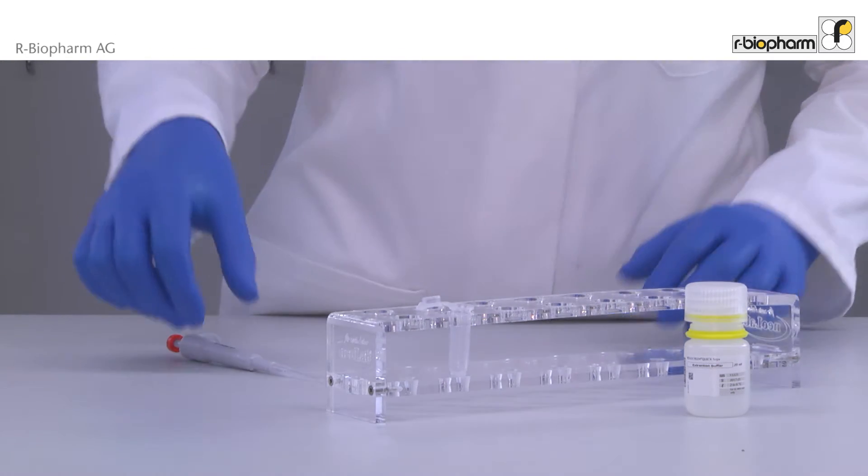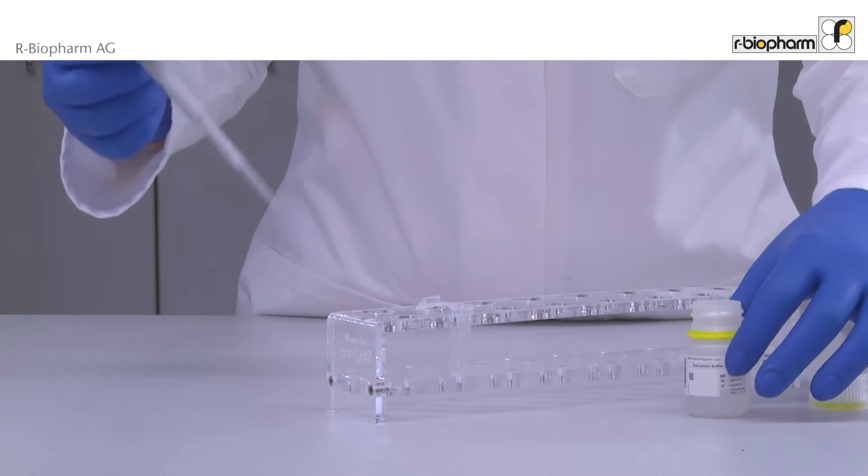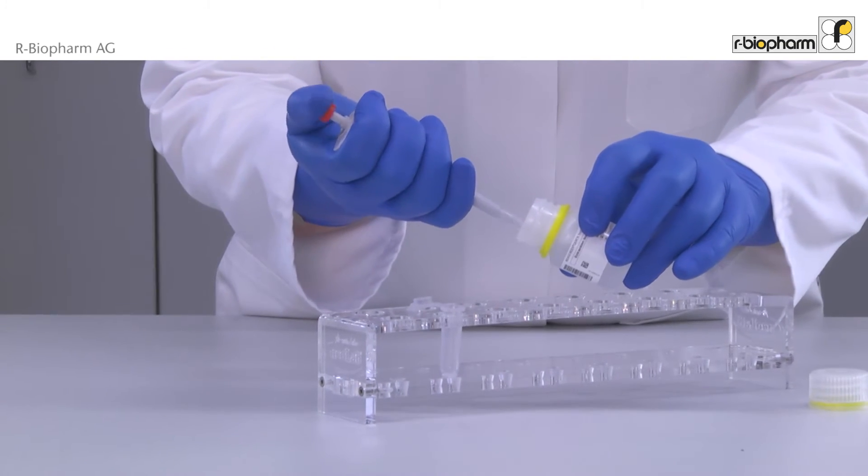To a 2 milliliter vial, add 750 microliters of buffer. For each swab, one vial is needed.